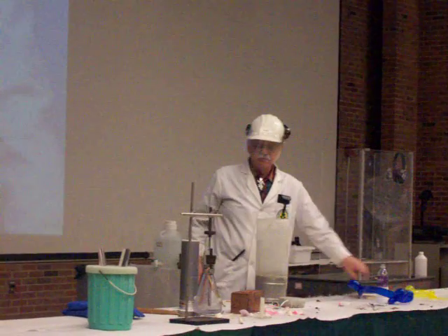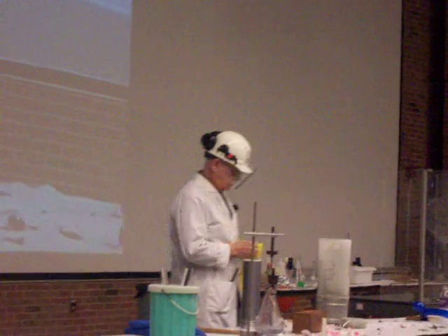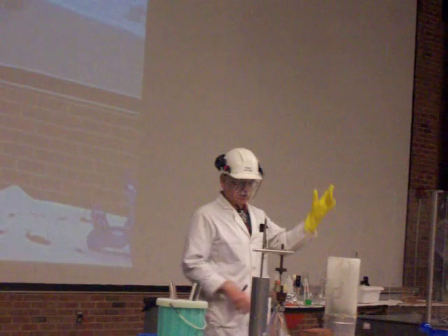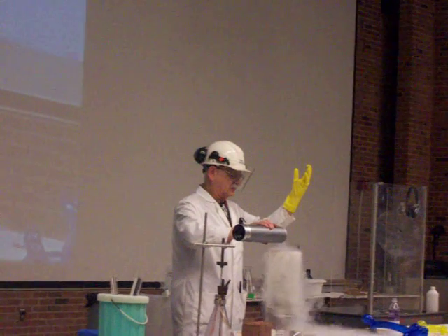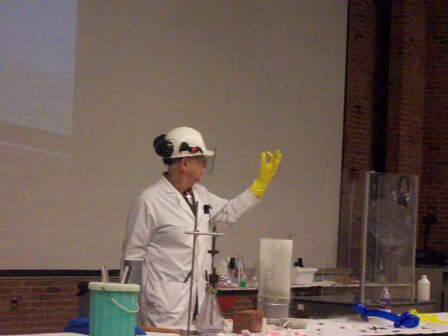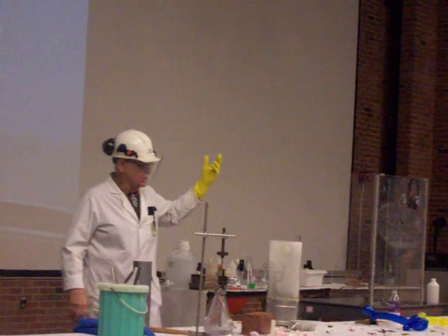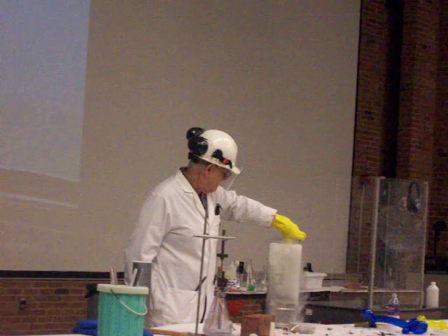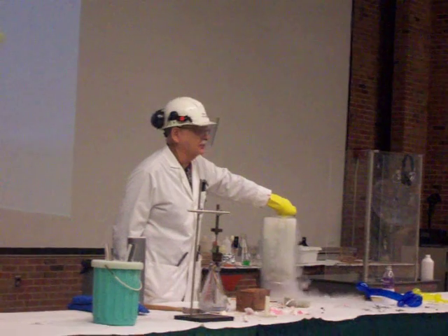Now, what might happen if I put my hand or part of my hand down in the liquid nitrogen for a long period of time? I have this glove here to protect the rest of my hand. So here we are. I'm going to put a little bit extra liquid nitrogen into the dewar flask. I'll put my hand down in the liquid nitrogen.